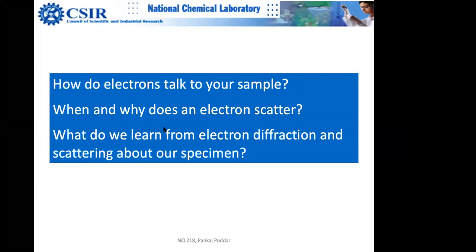So when I look at the electron scattering cross-section, if I have to calculate it, what I would like to do is look at the electron, which probably I will teach today or maybe in the next lecture. If you are interested, I'll discuss with Gaurav whether you want to learn about basic scattering concepts.